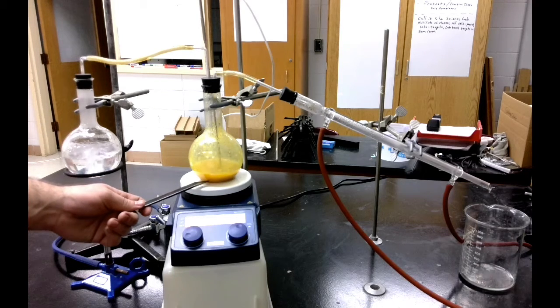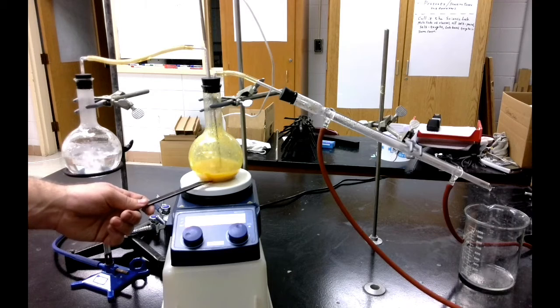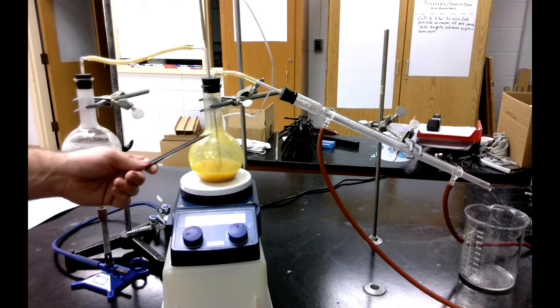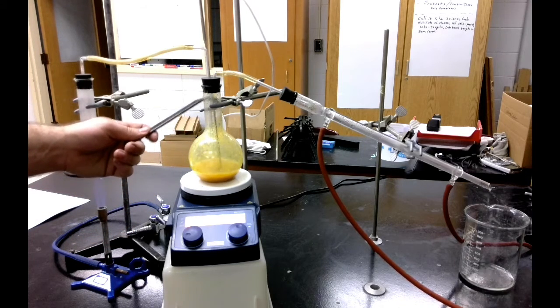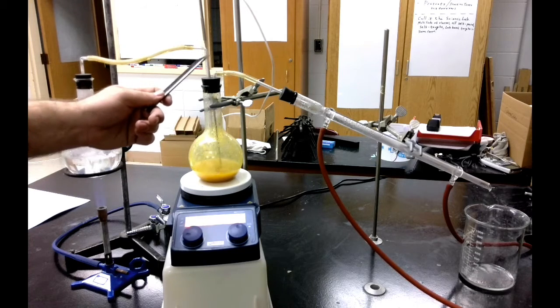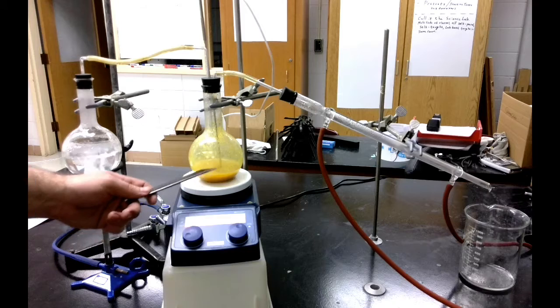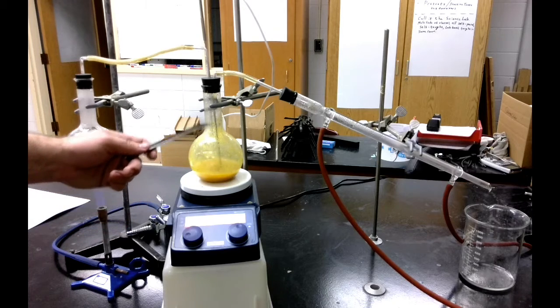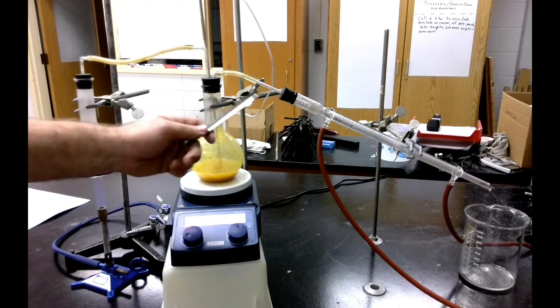That is going to convert from a liquid, it's an oil, into a gas, and it'll travel with the steam back up through this tube and out this tube. So this tube is sending steam directly into the fluid, and then it all travels up off the surface, travels through this tube and into the condenser.